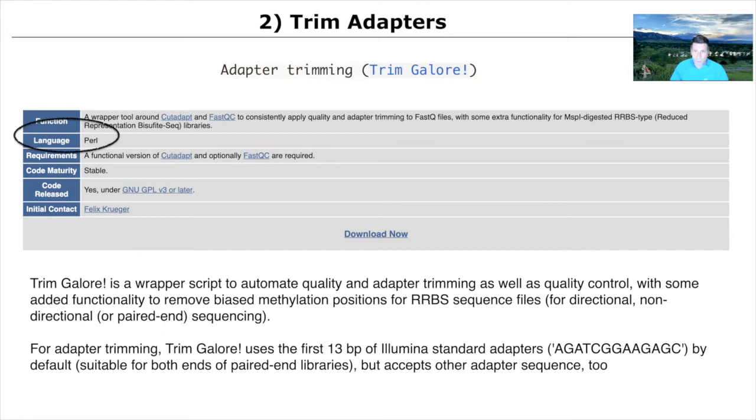This is done in Perl. I'm highlighting this because Nextflow can use all of these languages and all of these different packages that are made by different people and have different versions. It's a package manager that knows to go get all of these things, get the latest version of them, and put them in sequential order. And if somebody wants to reproduce your data, it'll give you all of the needed information of what was run in this pipeline.